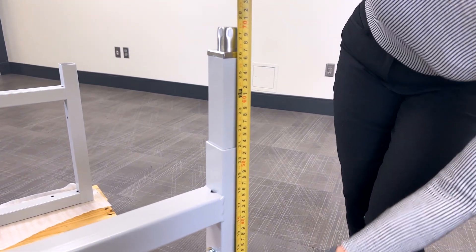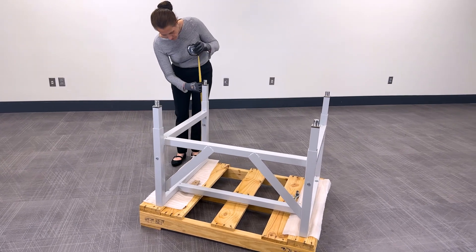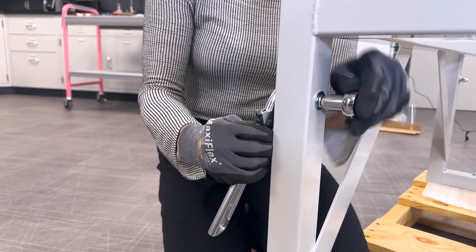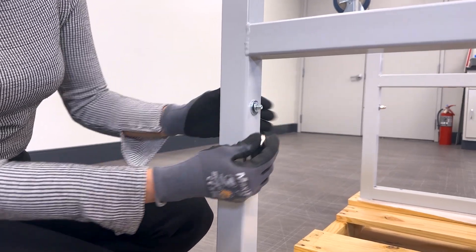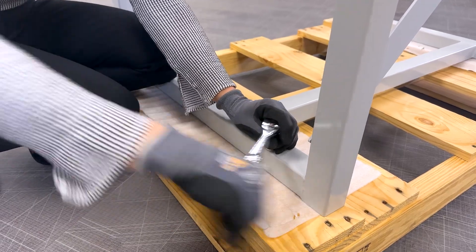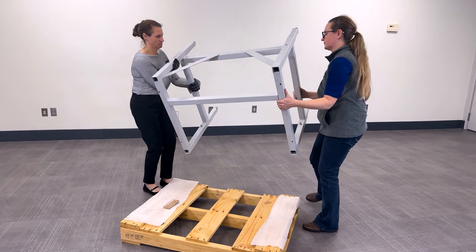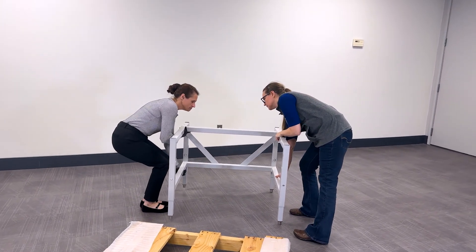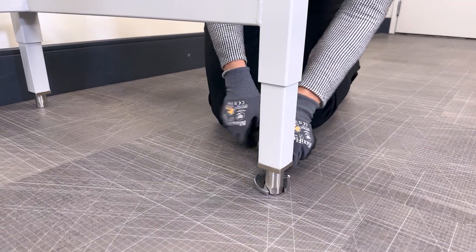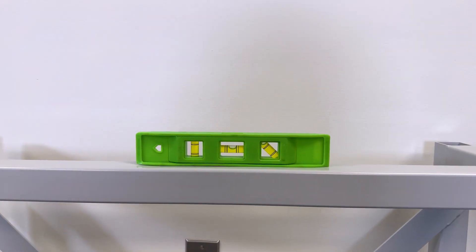Double-check final height measurements once the leg extension is installed. Repeat for the remaining three corner posts, ensuring the leg extension is set to the same height at all four corners. Securely tighten all leg bolts. Follow the same process for base stands with casters, but ensure that the caster wheels are pointing outward as shown. Next, use a 9/16 inch socket and ratchet or crescent wrench to loosen the stand from the pallet. Using two people, carefully lift the stand from the pallet and turn upright on the ground. Move the base stand to its final location and make sure it's level.